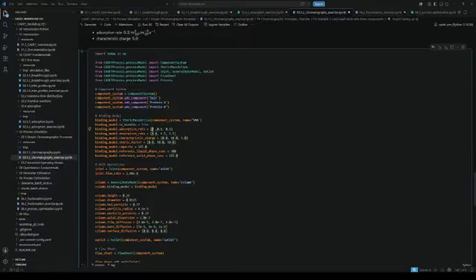The first component is again for the salt, and then we have component A and B, and we're now setting the adsorption and desorption rate. And as explained in the theoretical part, the SMA model takes into account a characteristic charge. So this is a value of how many binding sites one molecule of this component interacts with. Here our component or protein A interacts with 10 binding sites, protein B with 5 binding sites. Then we have the steric factor, and here both A and B are assigned the value 50. This means that one molecule binding to the surface also restricts 50 additional binding sites from being used by the other molecules and the salt.